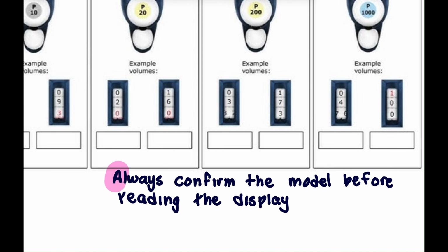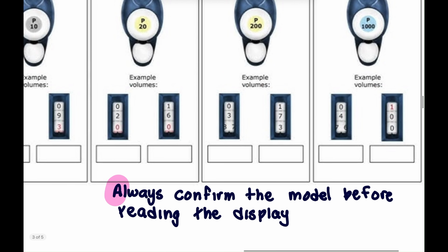One important rule that comes directly from the manufacturer is that you never use a micropipette that's below 35% of its total range. So a P1000 should not be used to measure volumes below about 350 microliters. If you need a smaller volume, you switch to the smaller, more appropriate model.